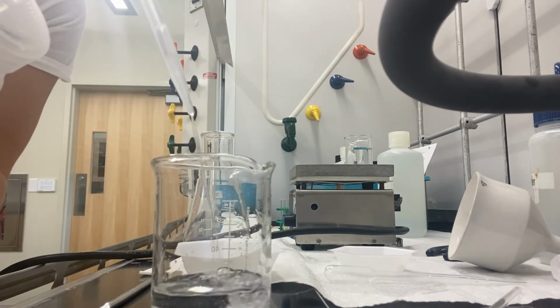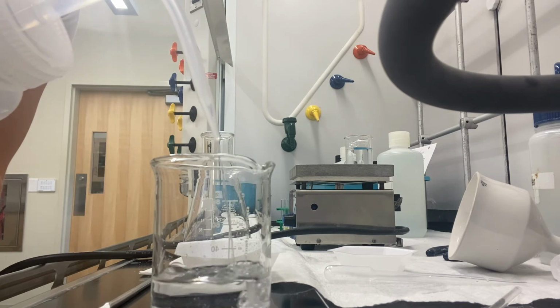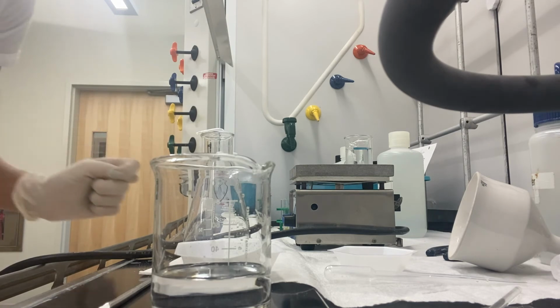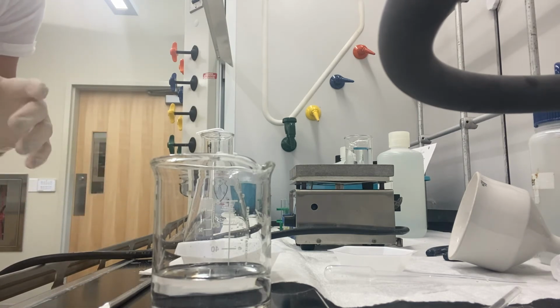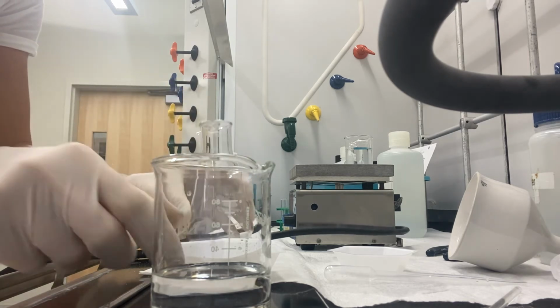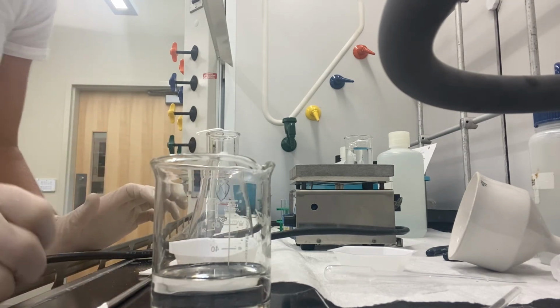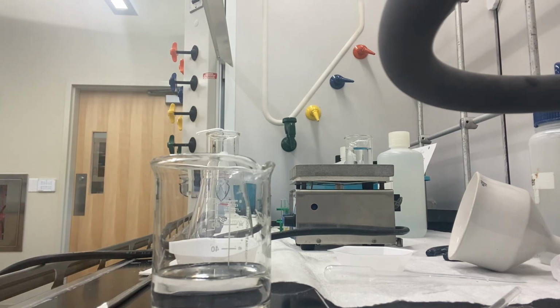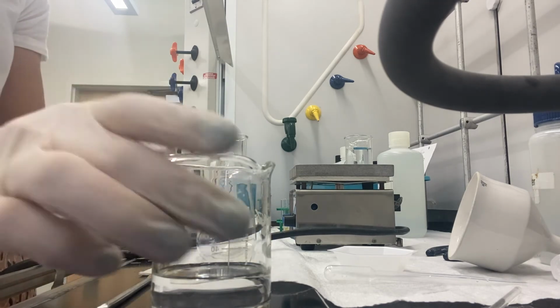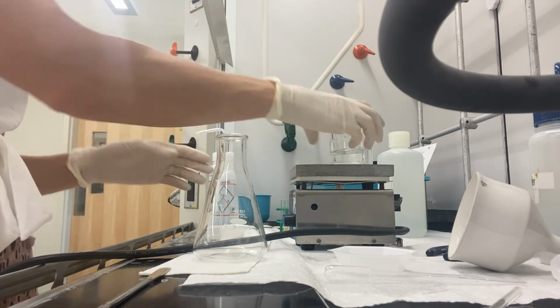So I'm just going to put some ethanol in a beaker, and we're going to get that heating. We want to be very careful because we know from our MSDS that ethanol is flammable. I've also got some water heating because I want to eventually add in twice the amount of water to our dissolved product in ethanol, and that way we can encourage that crystallization. It's useful to use one of these pipettes to help add either water or our ethanol. So I'm just going to put these guys on the hot plate so they can heat up.